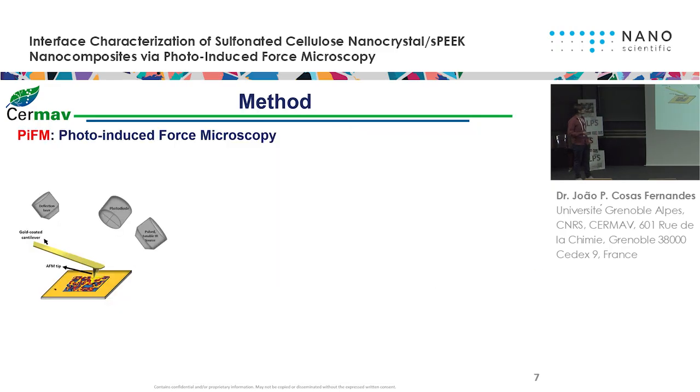And to try to answer this question, we use AFM-IR. Sorry, I'm going to explain again some cartoonish stuff to explain the method. Photo-induced force microscopy is an AFM-IR technique, which means that we have a laser to follow the motions of our cantilever, of course, but also a pulse-tunable IR source next to it that is also focused on the sample.